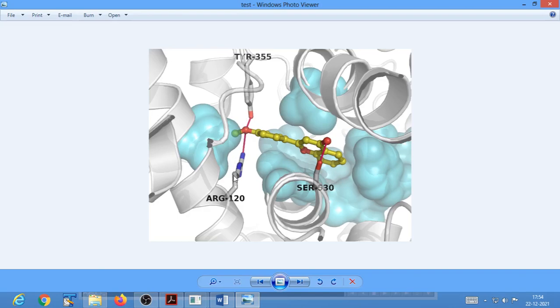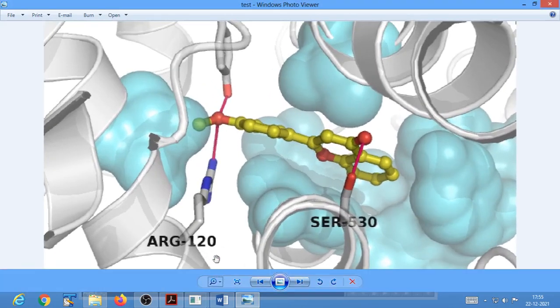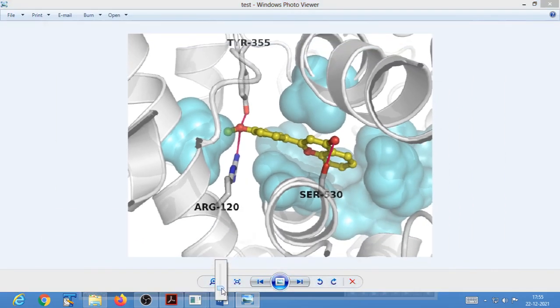But there is still some issue, right? The issue being that this is still a low resolution image. By default, when you use this save image function, it creates an image with low resolution, right? So what I mean is that if you try to zoom into this image, you can already see that the picture starts to pixelate like this, right? At this particular resolution, right?